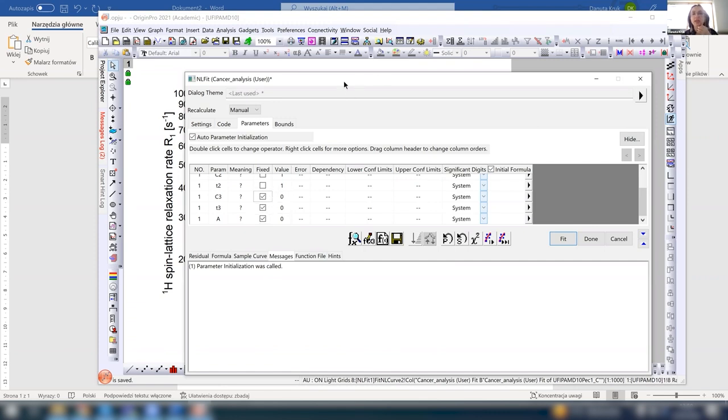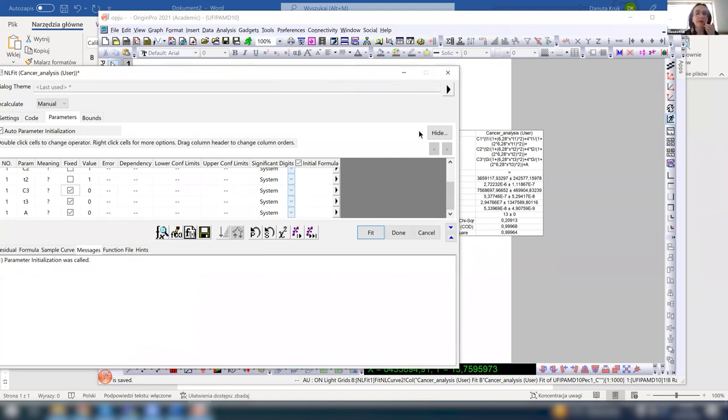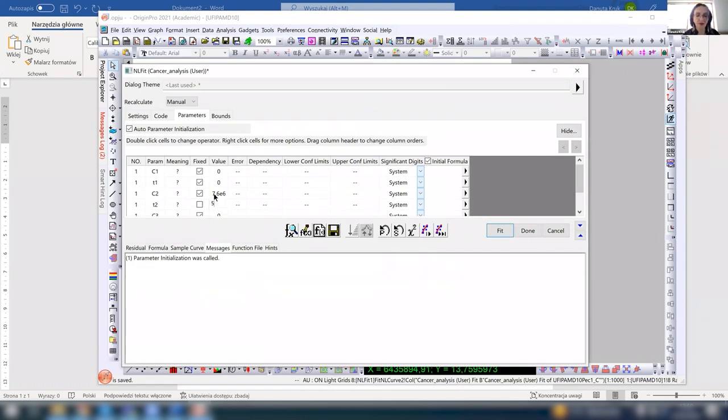And what we had here. So it was 7.6, 1, 2, 3, 4, 5, 6. 7.6 to the power 6. And here what we have, 538 minus 7.